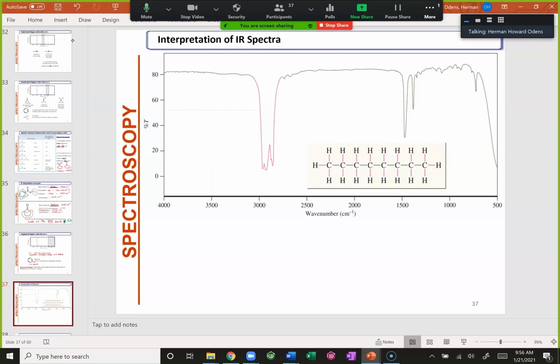So when you do spectra, let the spectrum talk by itself. This is the best advice I can give you. So we're not going to overinterpret anything. We're just going to let the spectrum talk to us. All right? That is the key for success in this section. All right, so there you have it.